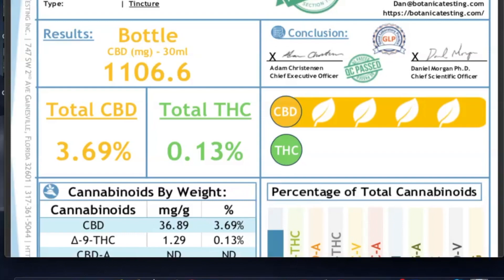I'm going to pop over and open that one up. As you can see, the oil that went into that product was 75% CBD, and it did in fact have CBD, CBG, CBN, and CBC as well — all those other minor cannabinoids that are so important to have that entourage effect.